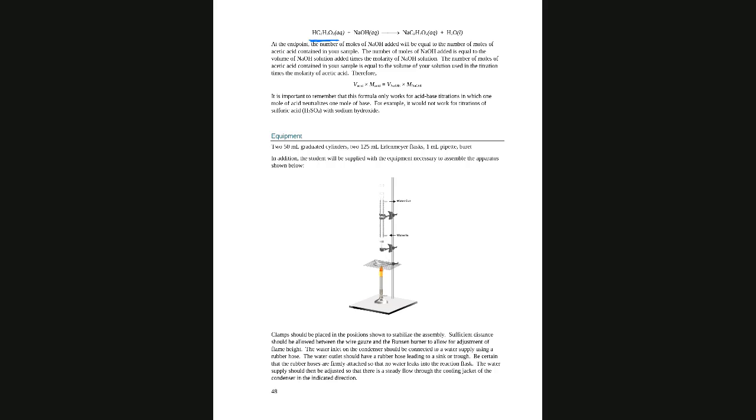We are going to do 3 titrations, and we are going to obtain the initial concentration of acetic acid and the equilibrium concentration of acetic acid, by using the volume of the one titration minus the volume of the blank.